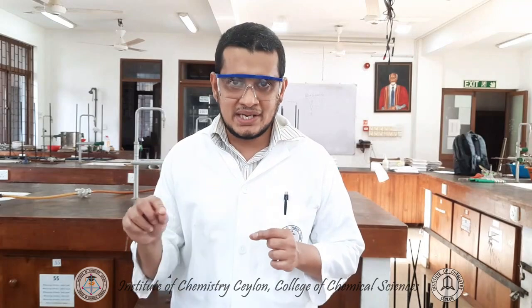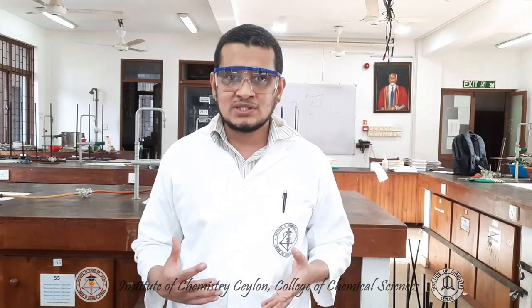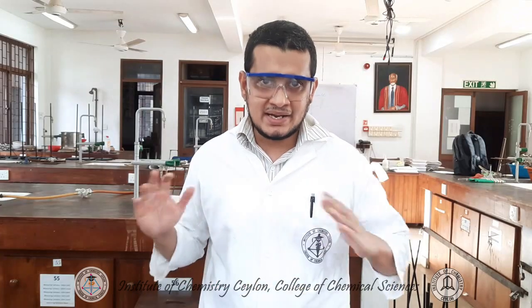And in any experiment, you have to write the title of the experiment, date, and the starting time maybe. And if you are performing a titration, you can record the initial titration reading, and if you are making a solution, from what bottle you took the chemical, and if you are weighing something, if you are using the balance, you have to take your book to the balance, and when you perform any weighing measurement, in there you can record the accurate weight you measured. And so the rough work book will be a complete record of the entire experiment you have performed, and later on for your calculations, that recordings will be extremely important.